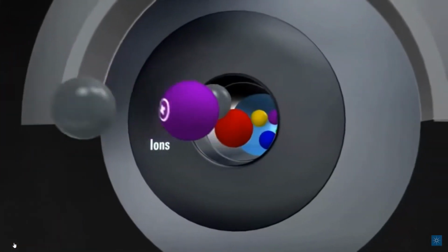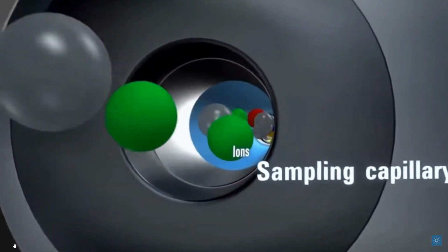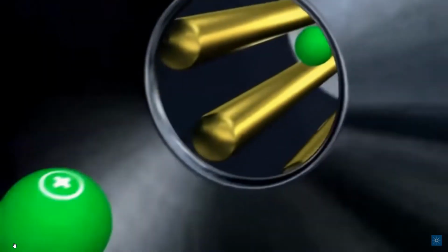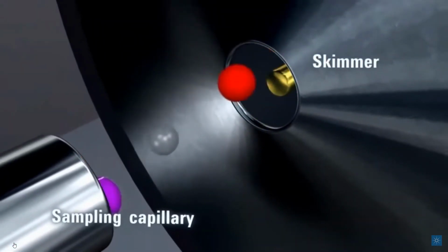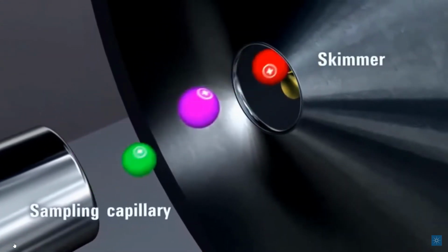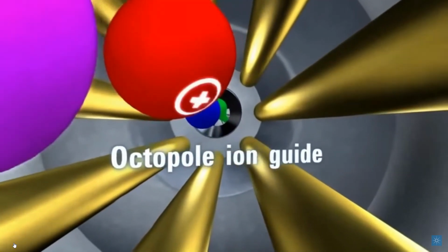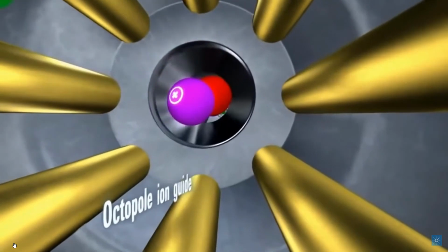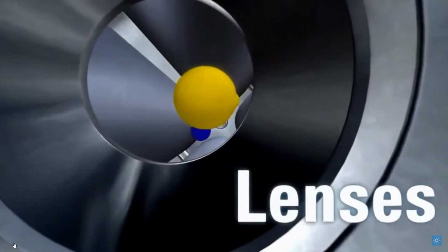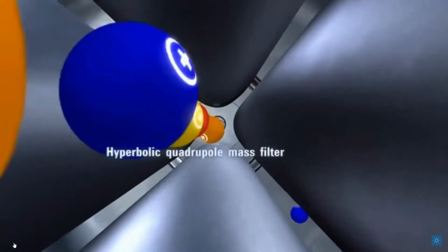As they enter the source, they will encounter a stream of hot gas, and they are desolvated, so that the water, the solvent is lost, and they become charged. The grey coloured particles, these are neutrals. We don't want those. All the charged particles you see have the same charge. They're all positively charged. They're passing now into the ion guide and through a couple of Einzel lenses, and they're now entering the first quadrupole.